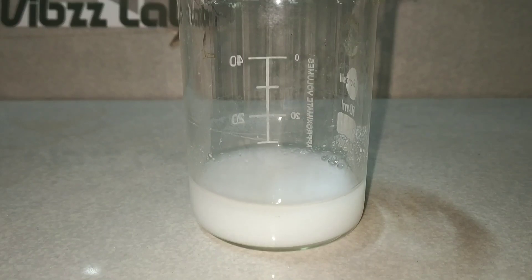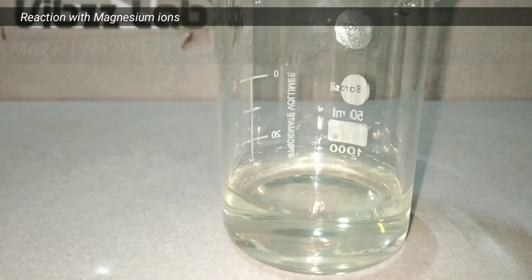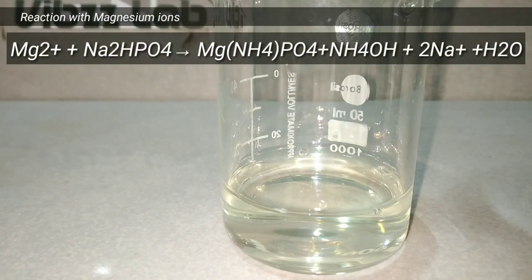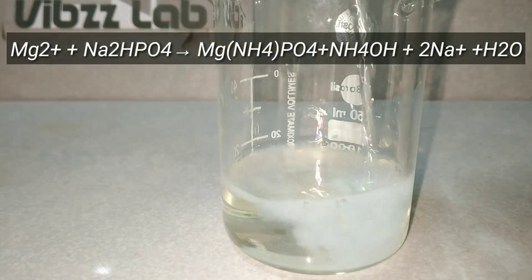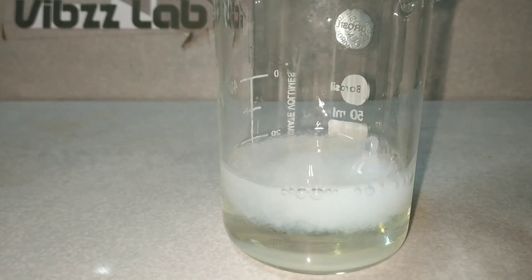And this is the white precipitate of lead phosphate. On adding disodium hydrogen phosphate to magnesium salt mixed with aqueous ammonia and ammonium chloride, we get a white precipitate of magnesium ammonium phosphate.